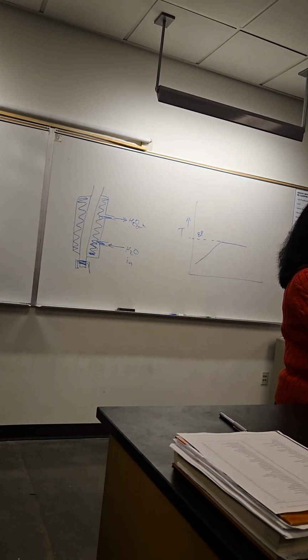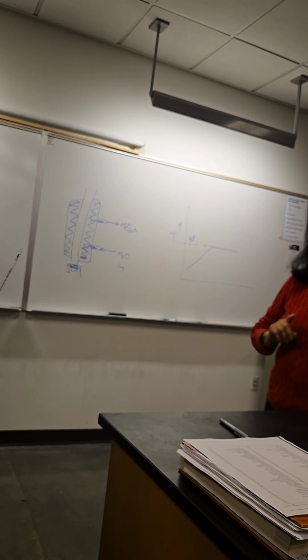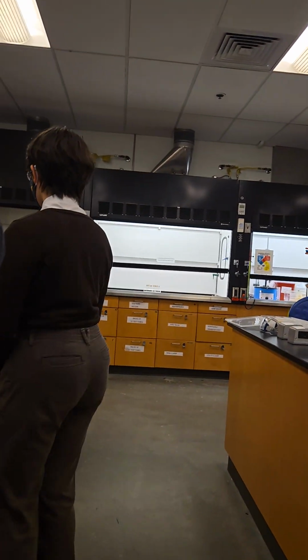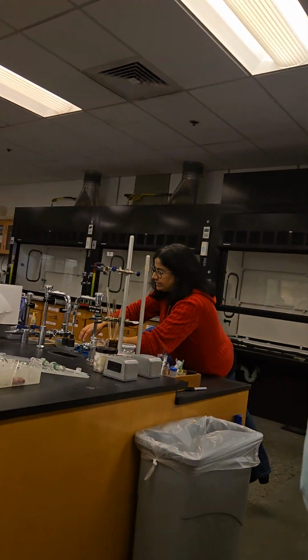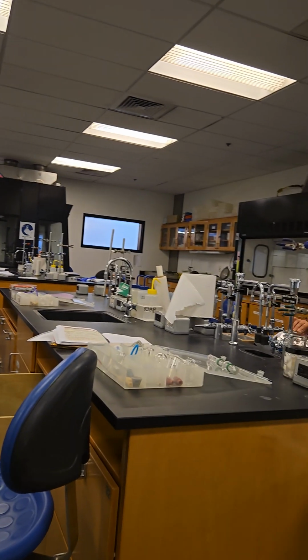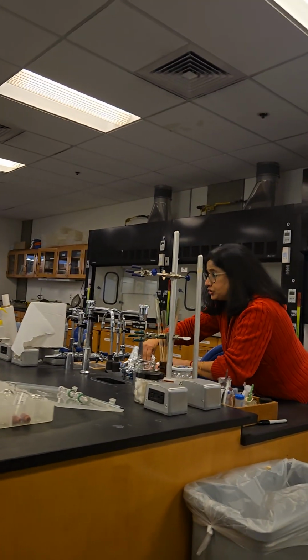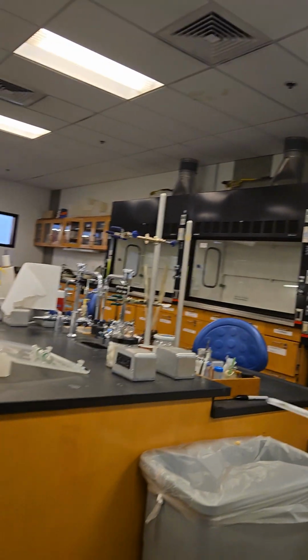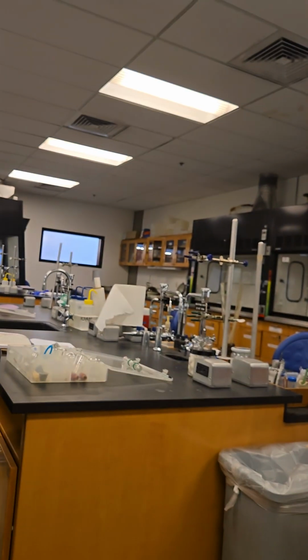But I have another suggestion. If you feel that your liquid is bubbling, but it's been too long and you're not collecting condensation, you're not collecting distillate, in that case, it could be the heat issue. Maybe the heat is enough to bubble the liquid, but the vapors don't have enough energy to go high enough and condense and become a liquid again.